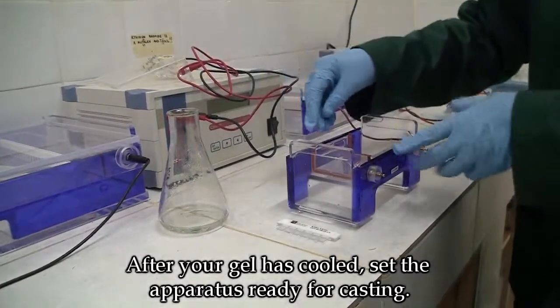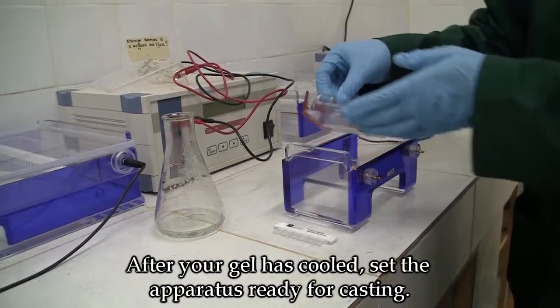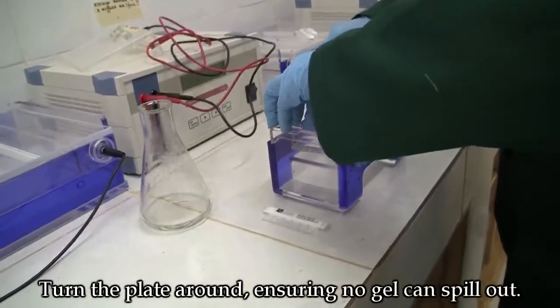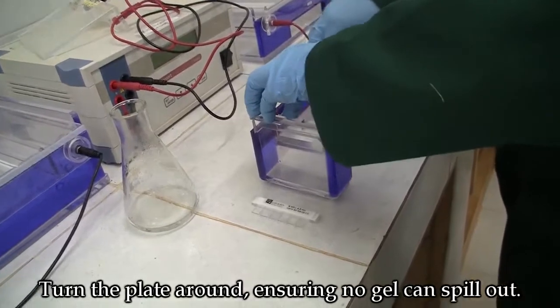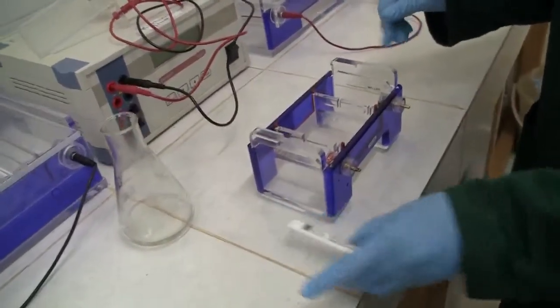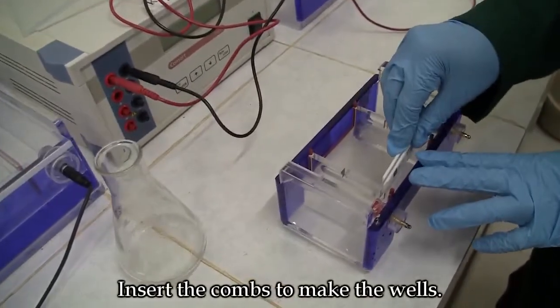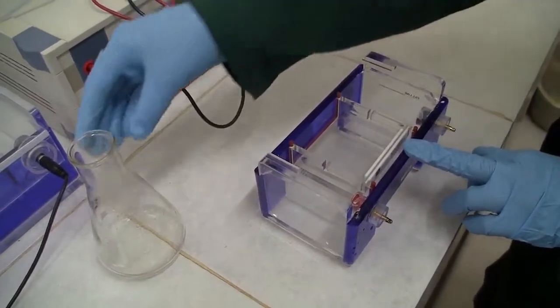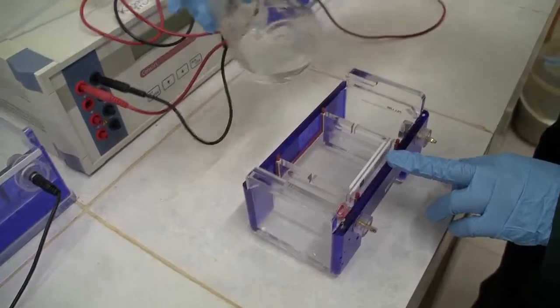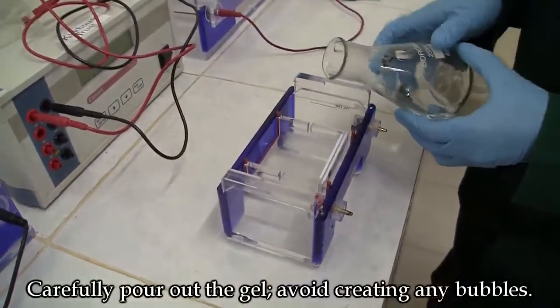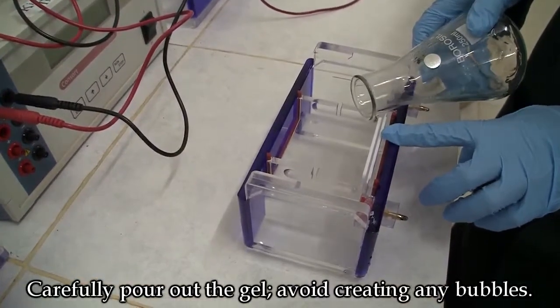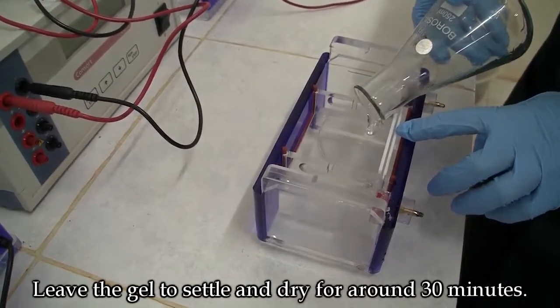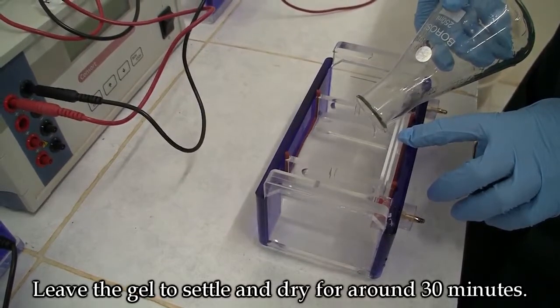After your gel has cooled, set the apparatus ready for casting. Turn around the plate and ensure that no gel will spill out. Place the comb to make the wells and carefully pour out the gel. Avoid any bubbles. Leave the gel to settle and dry for around 30 minutes.